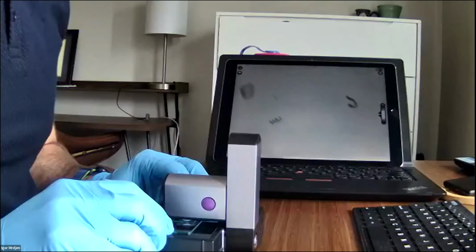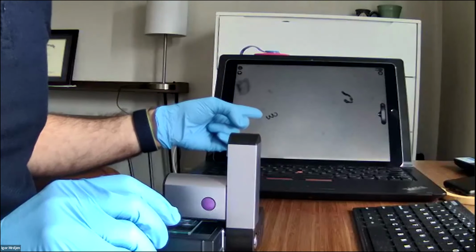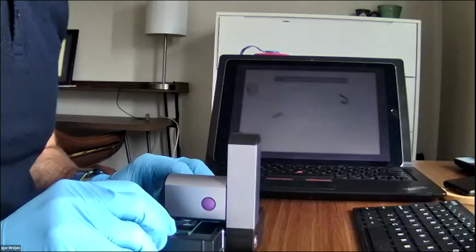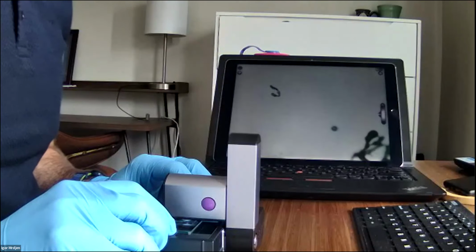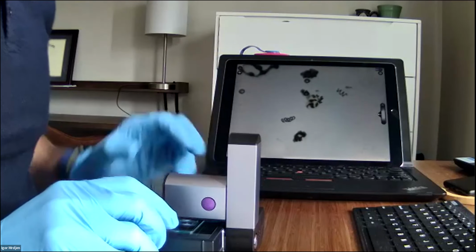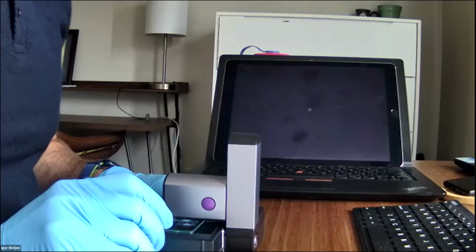Right, and so I'm just going to keep moving around. I see some Dolichospermum right there, very traditional and typical twisty colony formation there. So I'm going to take another photo and so forth. And for the sake of this demo, I've also collected a bunch of photos this morning that I'm going to show you how to upload to the AI. So yeah, I'm not going to do too many more this way.